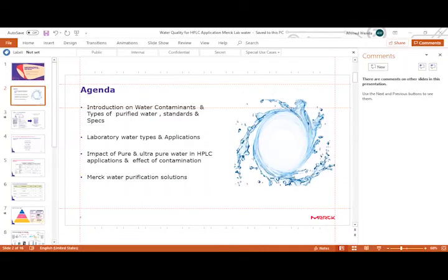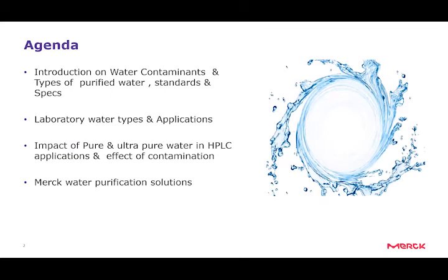The agenda for today: I have only 10 minutes to introduce all the available information that we can talk about in HPLC application. So the agenda will be introduction on water contamination, types of purified water, standards and specs, laboratory water types and applications, impact of pure and ultra pure water in HPLC application, and the effect of contamination. Merck Water Purification Solutions will be the last part, where I will be closing my slides.